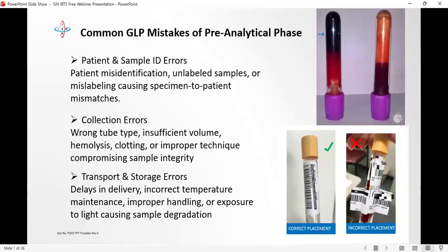If you look at this other picture, the one below, you see how the labeling was done. This is a facility that is using an LIS system, so you can see that this is a barcoded sample. You look at the first picture, and you see that it was properly labeled. Then look at this other picture. You see how the barcode is placed on the sample tube. So this is another error that can happen during the pre-analytical phase.